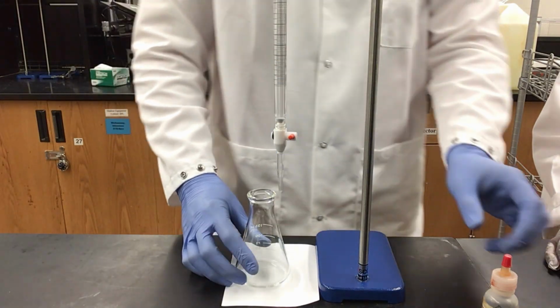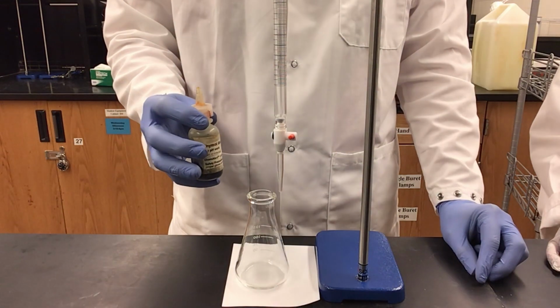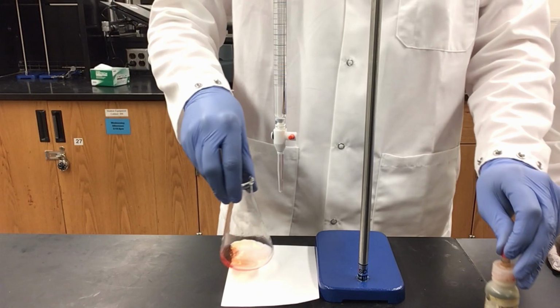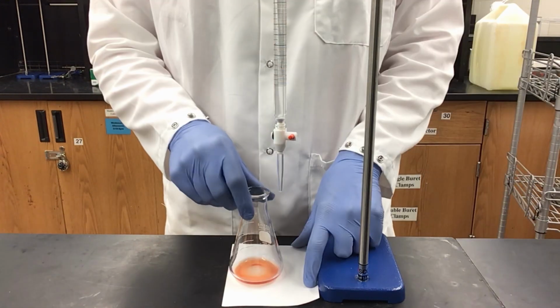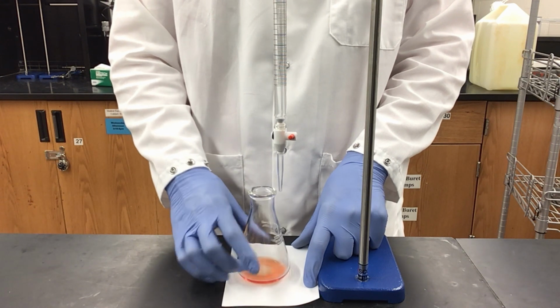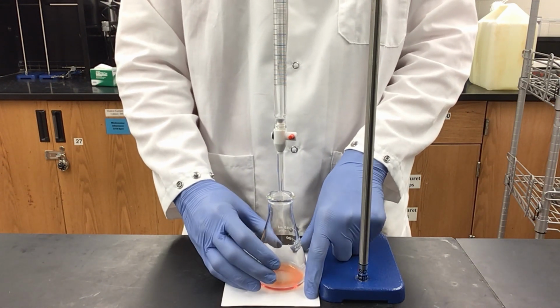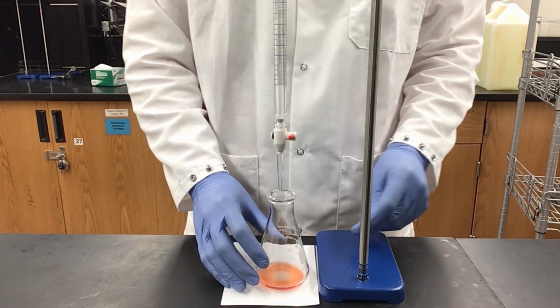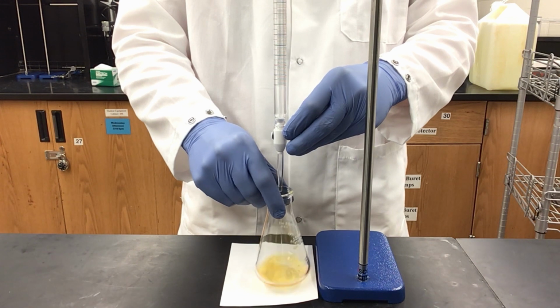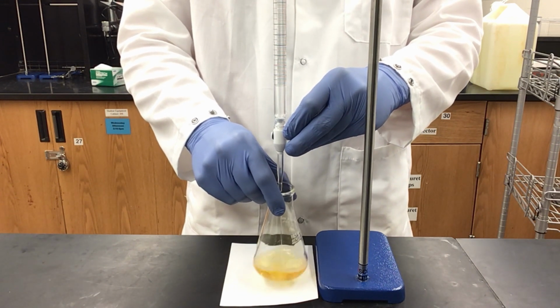Now that I have added my 5 mils of vinegar, I can add 10 drops of Thymol Blue Indicator and swirl. We are getting a pinkish color, but again, that is fine for Thymol Blue because that is just what it indicates if it is at a significantly low pH. So I can start my titration. As you see, we've already turned back to the yellow color that we expect.